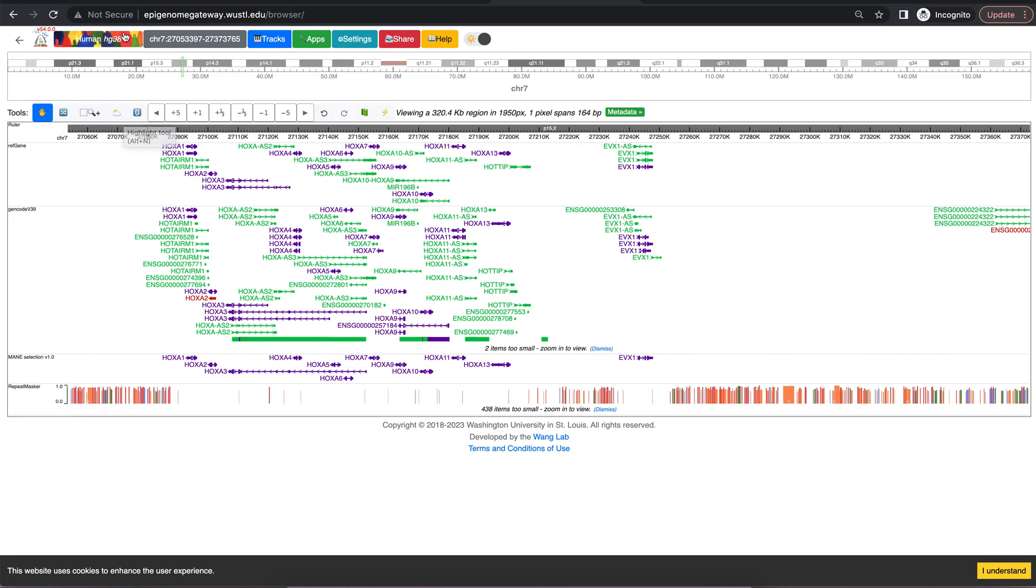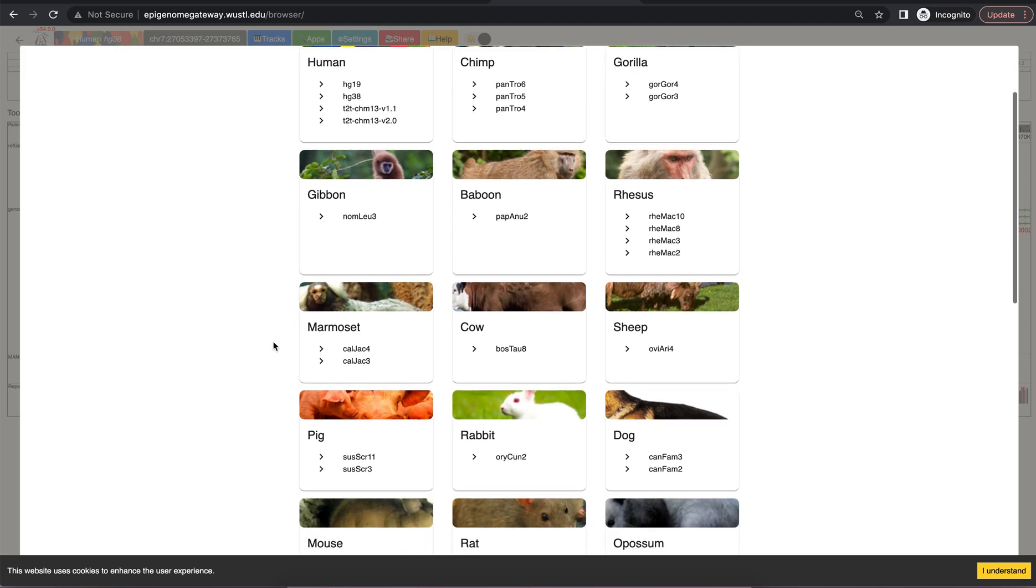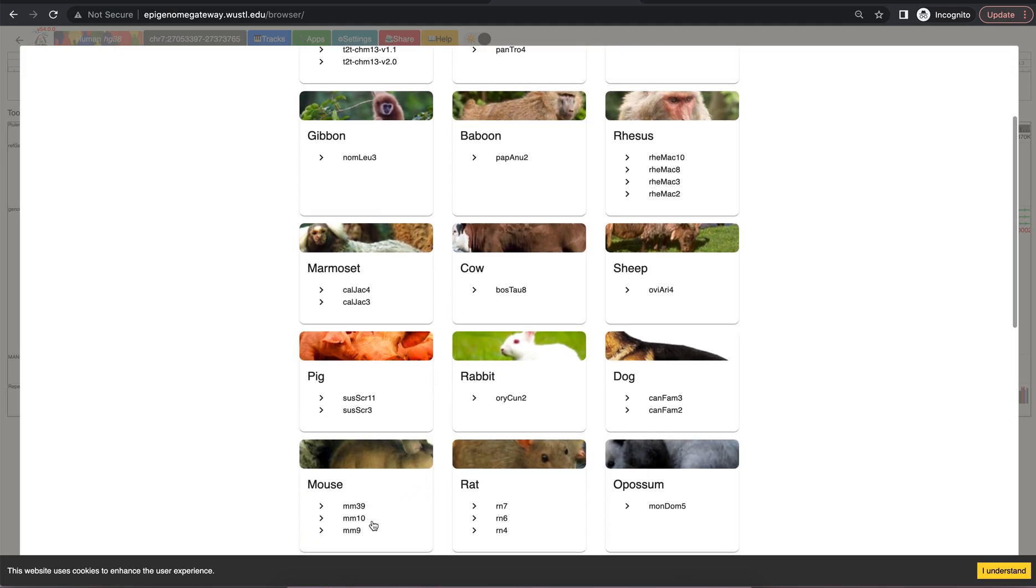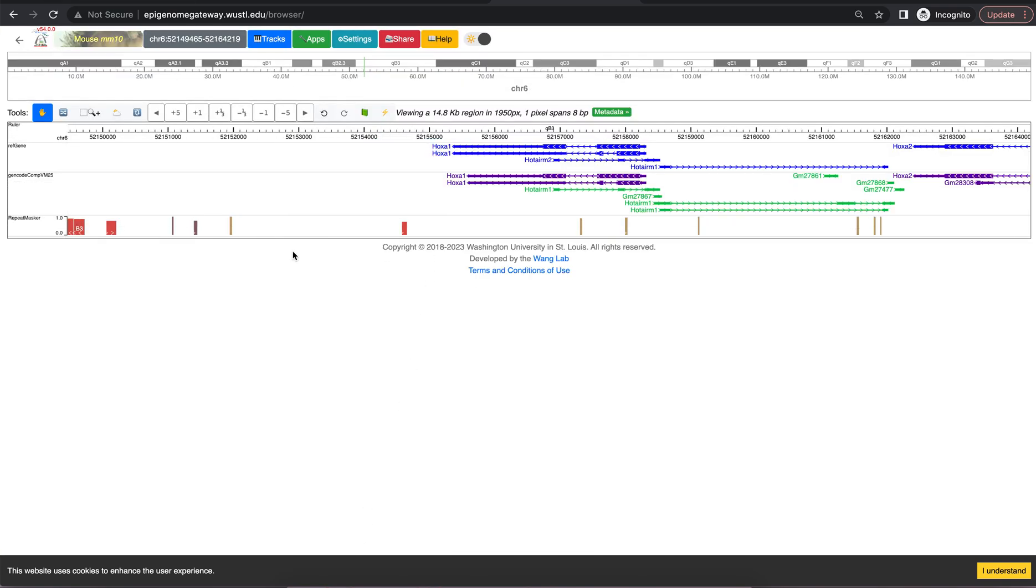You can change genomes by selecting the genome that you have chosen and then navigate to a different one. So let's say we want to look at mouse. We click the genome and the reference of interest and then now we're looking at the mouse genome. We can see that in the top left corner.